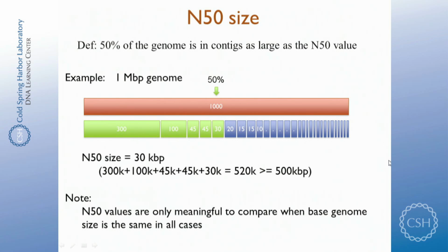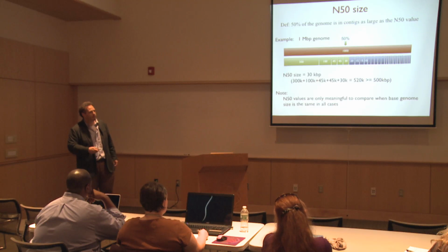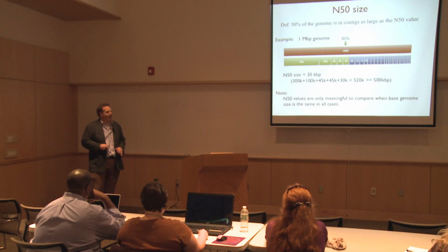This is the most common scenario where you get a few very big ones and this long tail of little teeny tiny ones. These all represent very complicated repeat structures or any residual error in the data. This is always what you get. So, all things being equal, comparing two assemblies to each other, you definitely want a larger N50. Although, like I said before, if people have been trying to optimize for it, this is an easy metric to cheat because you can just smash contigs together. Have to be a little bit careful.